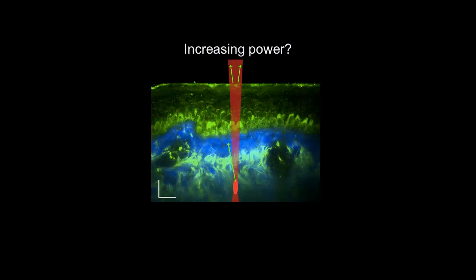Is that with nonlinear or no? Yes, with nonlinear. The only drawback to that is that it's quite limited for in vivo imaging. You can't quite image on patients with that. But they've been working, as far as I know, on mouse models where they pull the skin, or whatever they are imaging, an internal organ, and squeeze this specimen in between the detection and the delivery light optics.